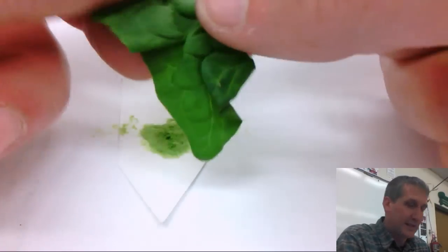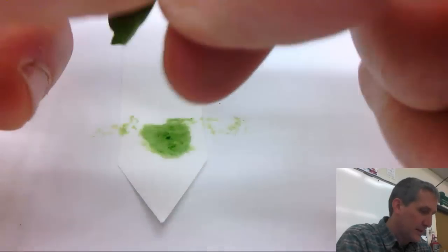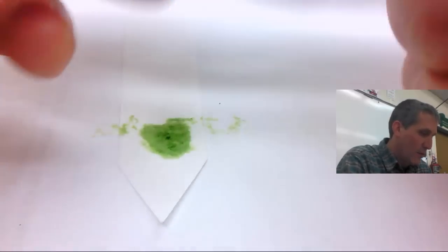If your one piece gets all smushed you just grab another piece, roll up a little piece and then add more.